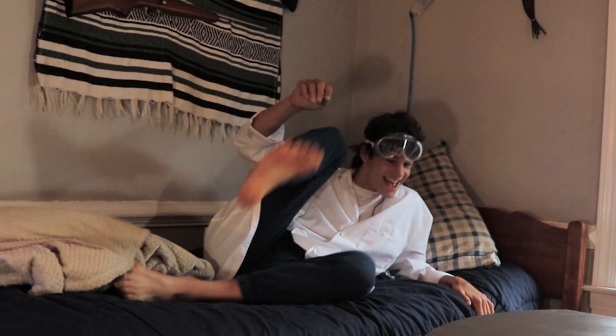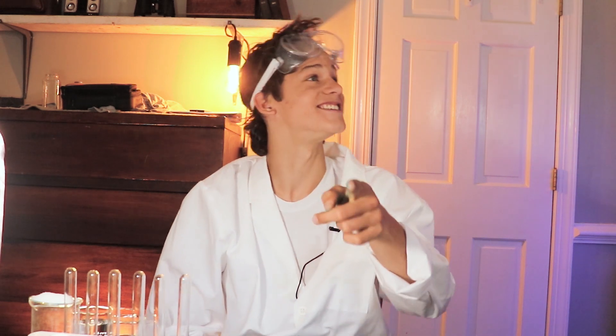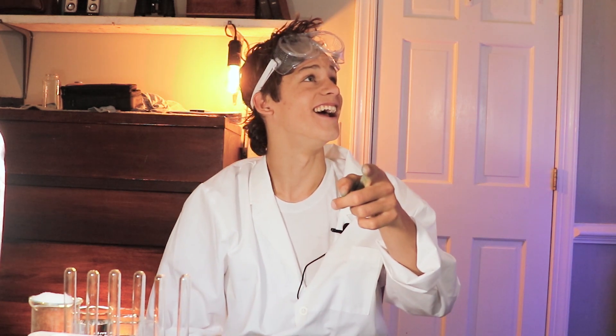Rise and shine, SCIENCE TIME! Welcome! Today we'll be doing an experiment — Experiment 5.2, titled Solubility of Ionic Compounds and Polar Covalent and Purely Covalent Compounds.